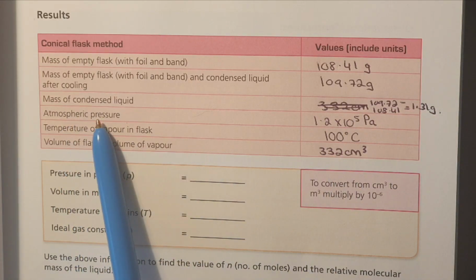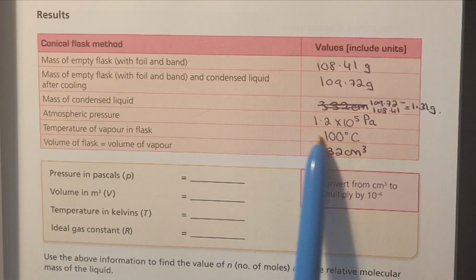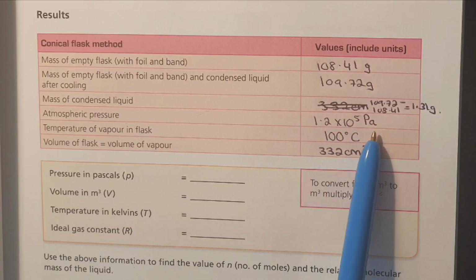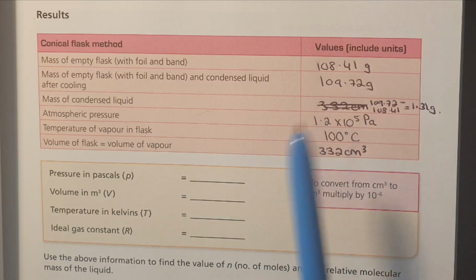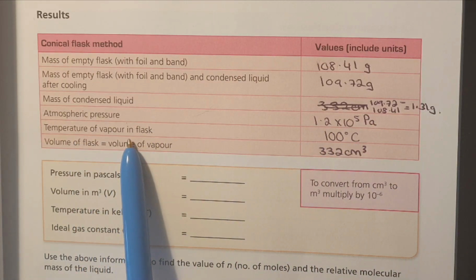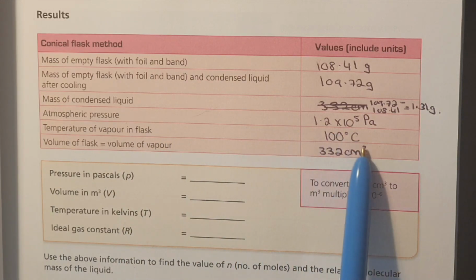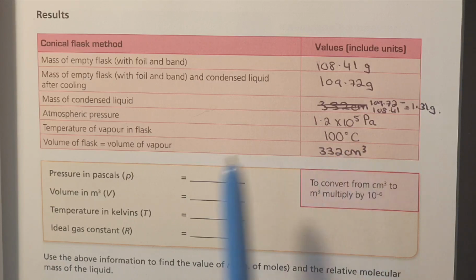The atmospheric pressure then you measured, and you should have a different number here possibly. I got 1.2 by 10 to the 5 pascals. And if you have a machine that measures kilopascals, just convert it into pascals. Temperature of vapor in the flask, well, the boiling water was 100 degrees Celsius, so that means the vapor inside the flask is also 100 degrees Celsius.